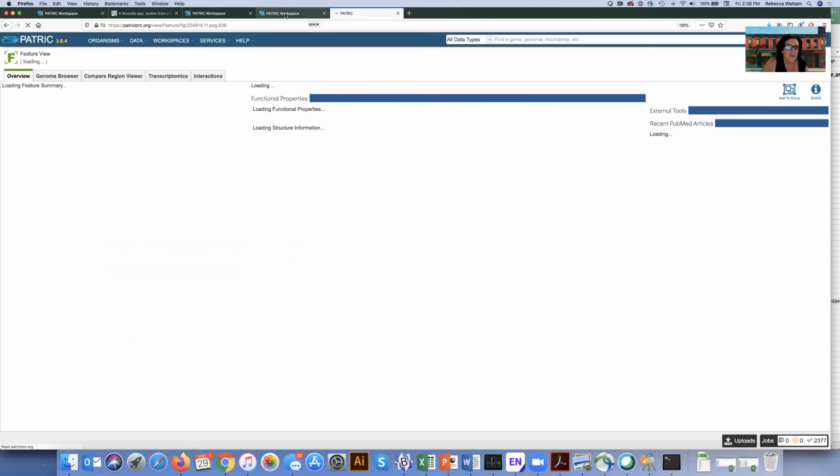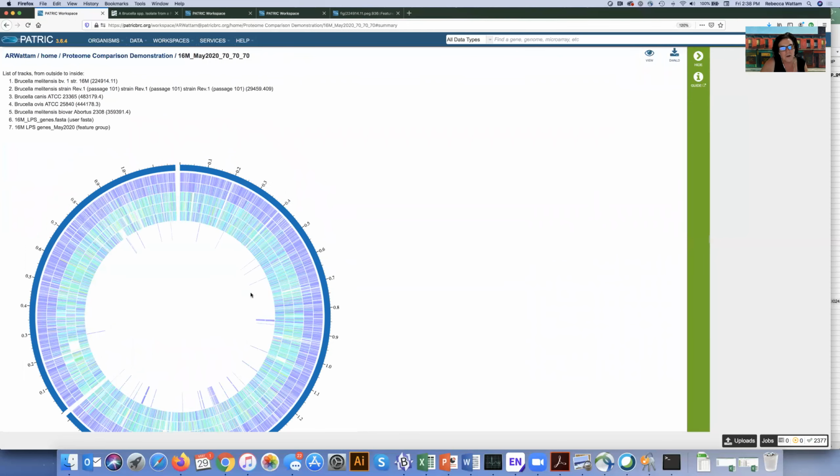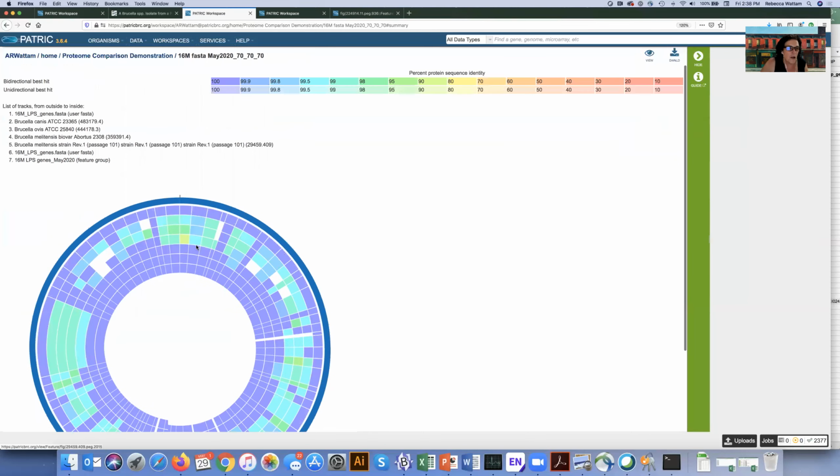But I'm not even interested in waiting for it to load because you've got this, which is showing you the things that you were interested in, in the context of this whole thing. So it's like blowing up these two lower circles. But I'm just really impressed with this, which is giving you all the data. This is a large gene here, and you can walk through it.